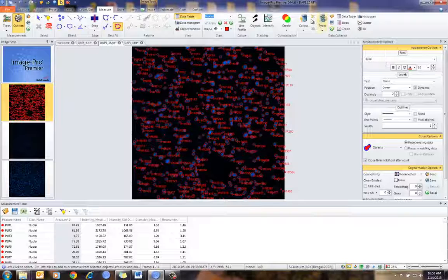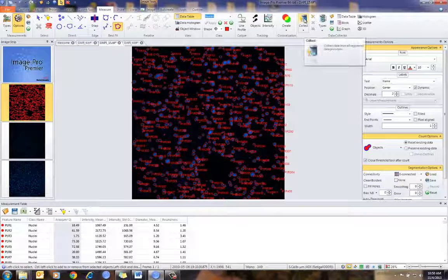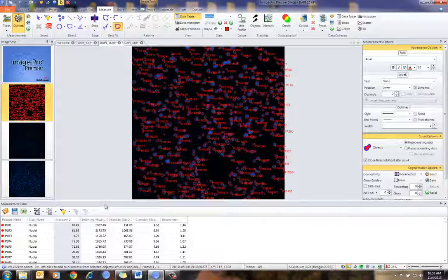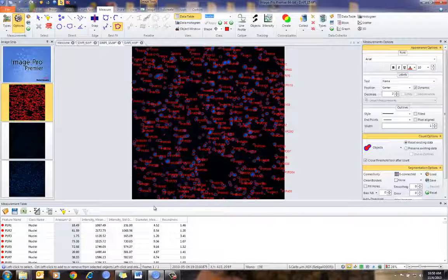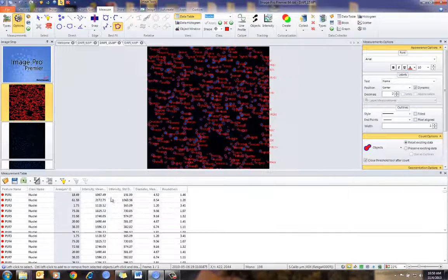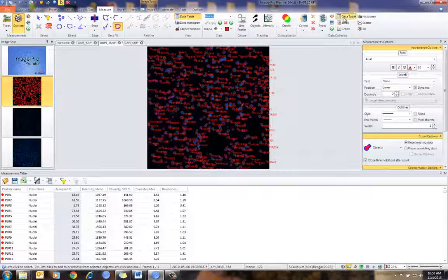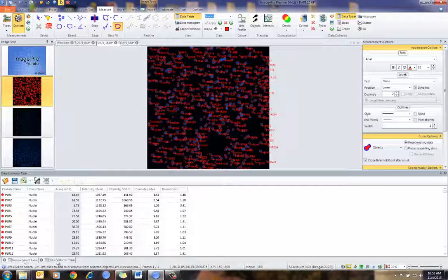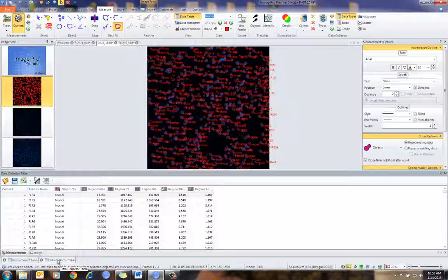At that point, I press collect. What that is doing is collecting the data into Data Collector, which you can see here. Let me just pull this table up a little bit. You'll notice I have a measurements table, and now my Data Collector table as well.